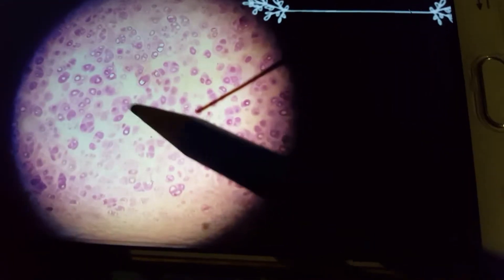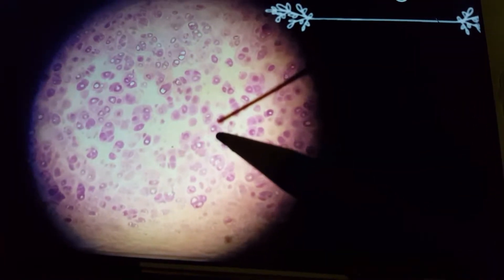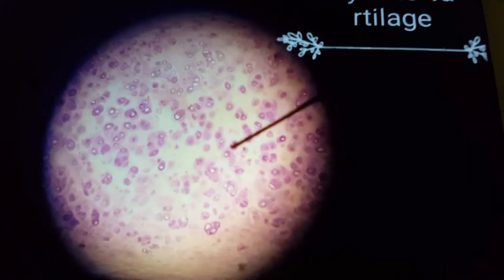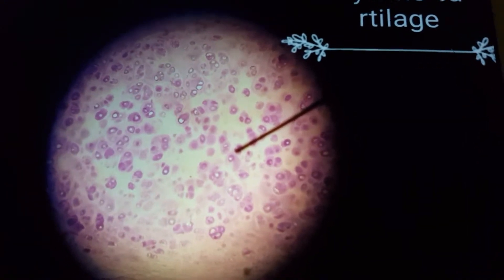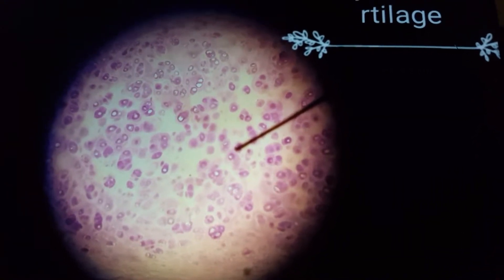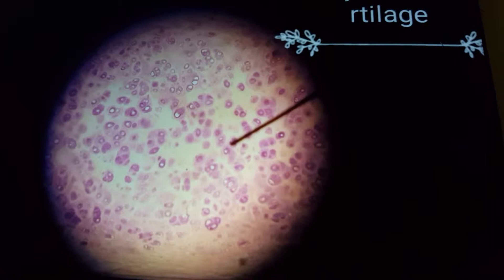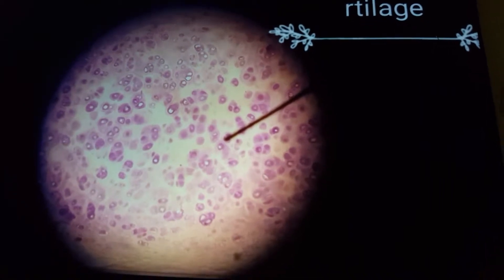So you can see here a lacuna, and in that we have a chondrocyte. The three identification points of hyaline cartilage — in every cartilage except fibrocartilage — the first point you will write is perichondrium.